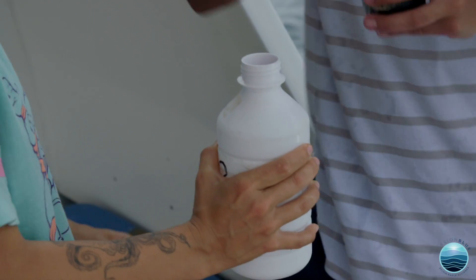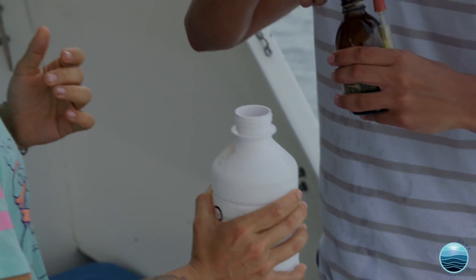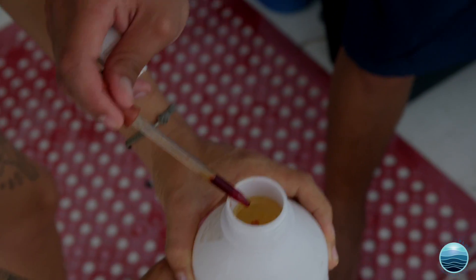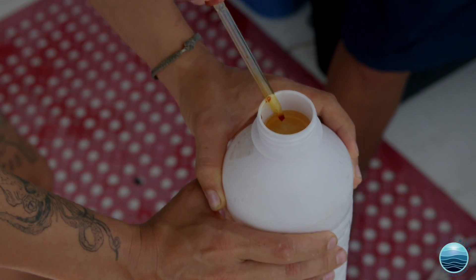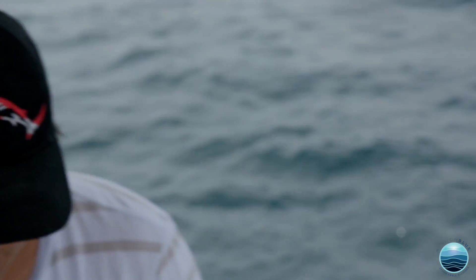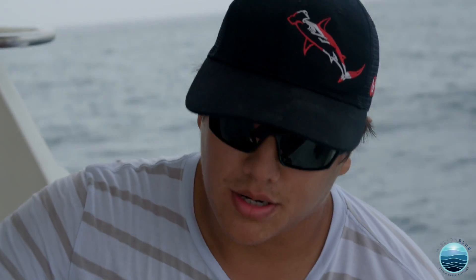Now this is the solution to fix the sample, which is iodine. This gets inside the phytoplankton cells so you can see them better at the microscope and do the taxonomic identification, which is our main goal.